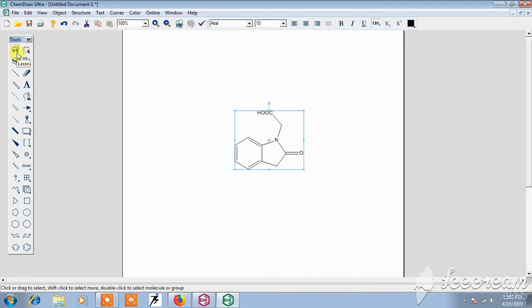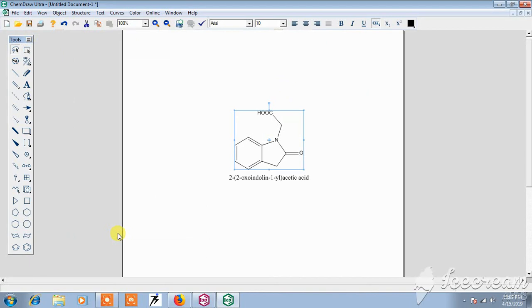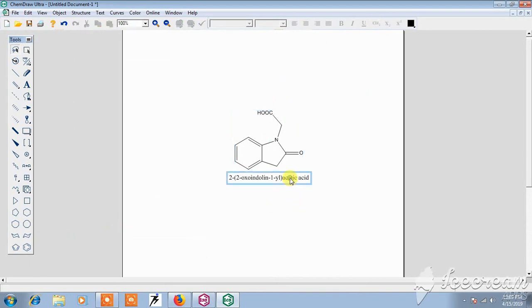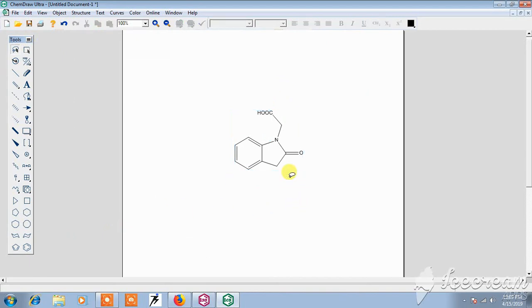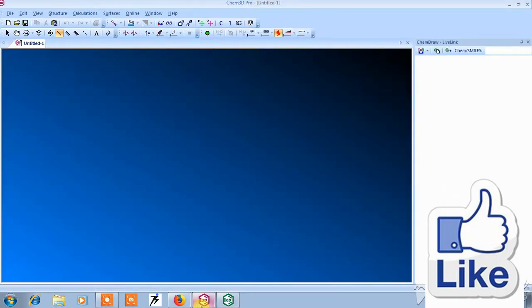If you don't know the structure, just select it and convert structure into name. This is the name of the structure. Now copy this structure and paste into Chem3D Pro.